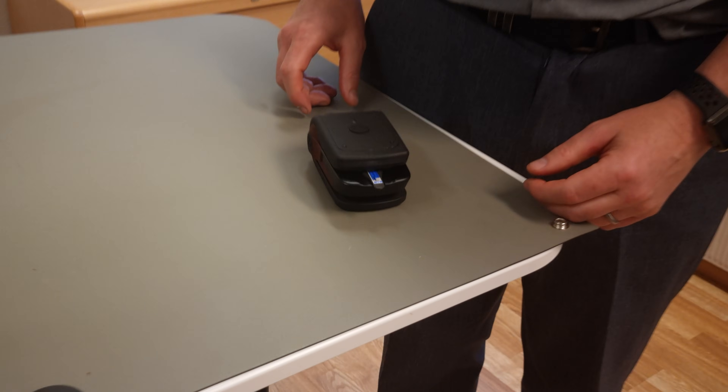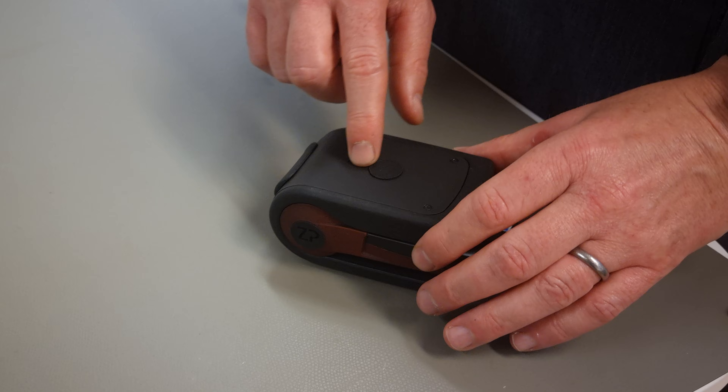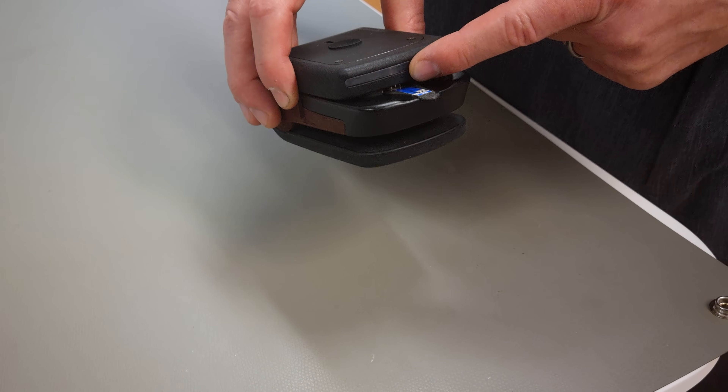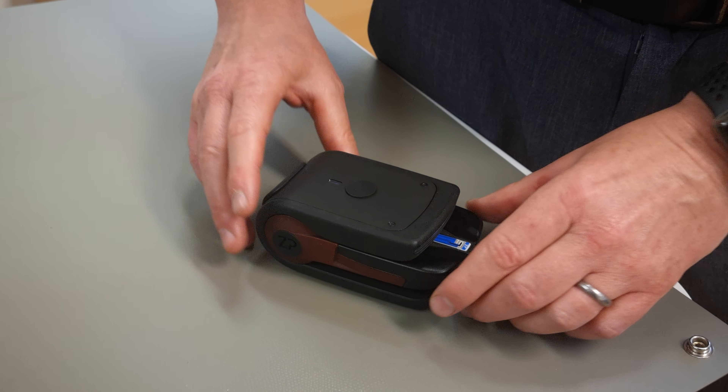I'm going to give you a quick introduction to Sensi All. Sensi All is a platform for people who want to develop electrochemical sensor assays. If you just come in quickly, what you're going to see about Sensi All — this one I haven't got powered on — but there are LEDs here and at the front, and these LEDs will actually guide the user to know what's going on.